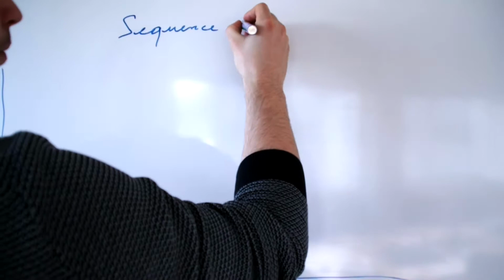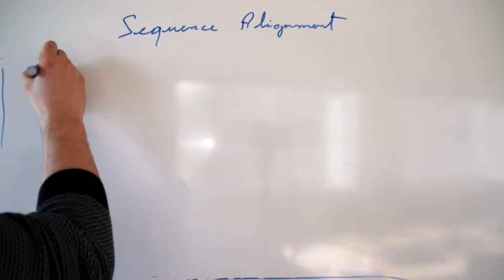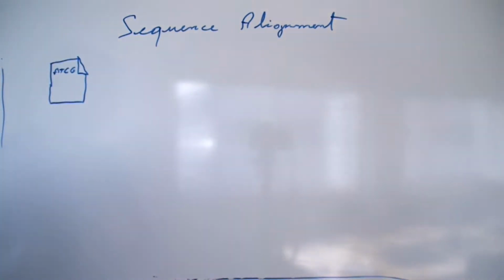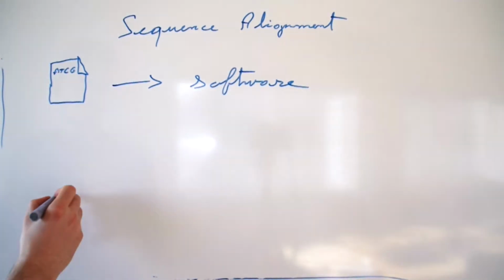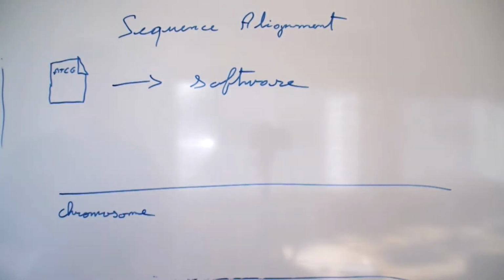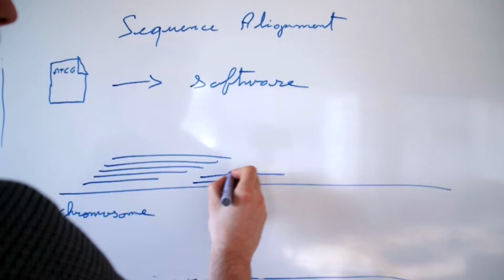The sequences of the fragments that the sequencer has been reading and putting into files have to be put in order according to a reference sequence. And then once your sequences are aligned to the genome, you can try and see what are the parts of the genome that have a big pile up. It could lead to a region where your transcription factor actually bound.